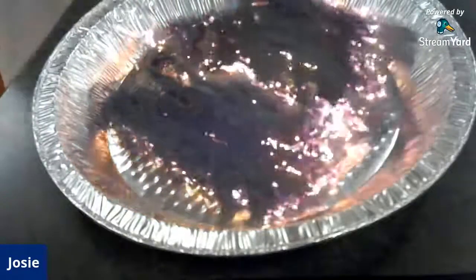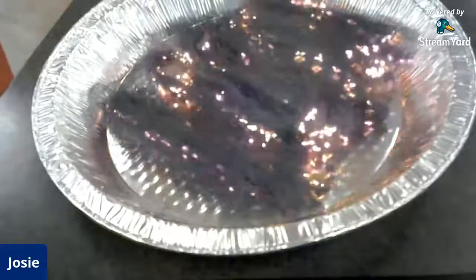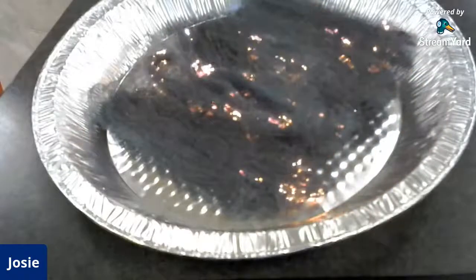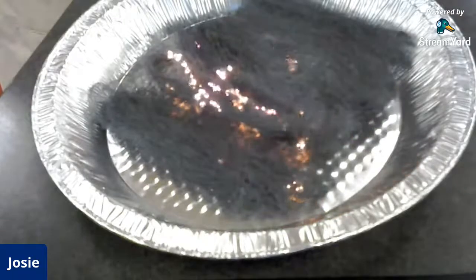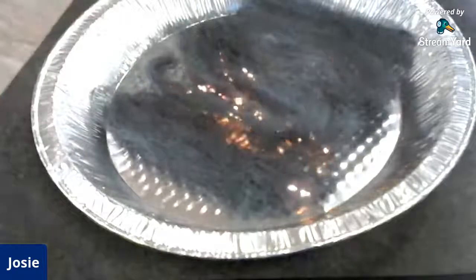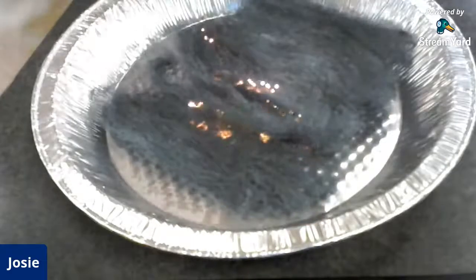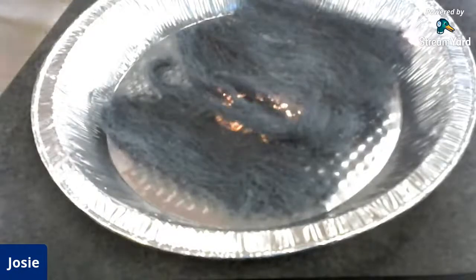It kind of looks like a bunch of little ants, is a good way to describe it, because I know the video quality isn't perfect. You can see it's still going, the reaction's still going on. And I can keep touching it a couple times. You can kind of see the color change, but that's because of the reaction going on. But there's parts that are still the light gray color, which you can touch again with the battery and set them off again.